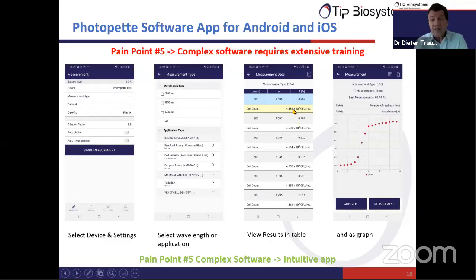So in this example, if you choose E. coli as measurement type, you can also do continuous measurements. Actually, we have a function that you can program. For example, you can program, I want to do 600 measurements every 2 minutes or something like that. And then the device will do this automatically for you, or overnight or something.